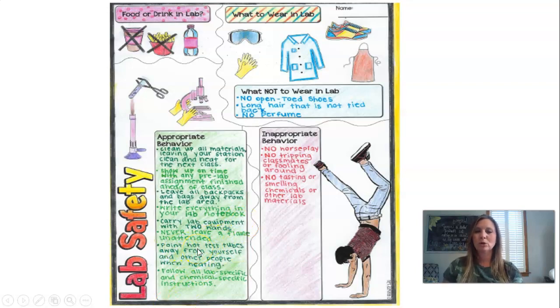Point hot test tubes away from you. So don't be staring over top of something, because it could splash and come right up into your face. We don't want that. So always be very cautious, and if you've heated something up, make sure you're not holding it right next to your face. Always make sure that it's pointed away. And then finally, always make sure that you are following the lab safety rules.